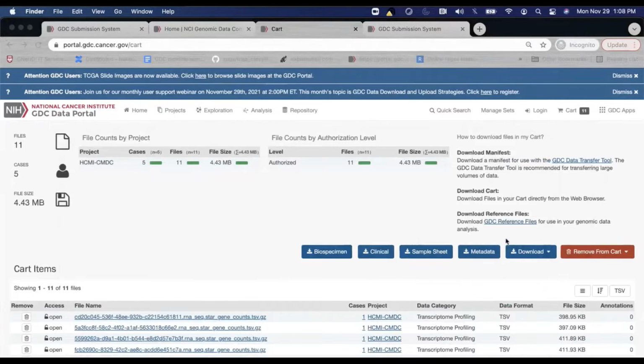since we're in the cart, I could show you a little bit about what's going on with these buttons. One of the things, if you're doing a research project, that you may be aware of is that downloading the files is important, but knowing about the files is also important. Knowing things about the patients, where the DNA came from, etc. So that's where these buttons come in.